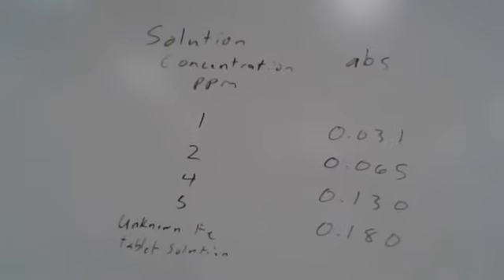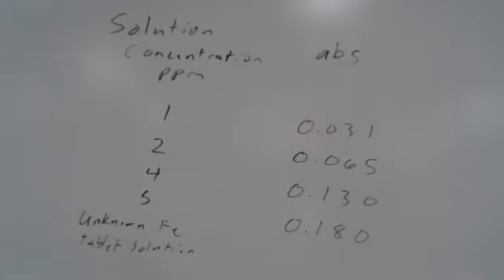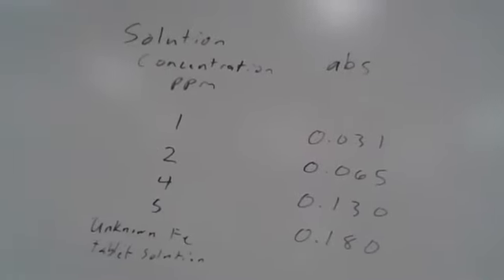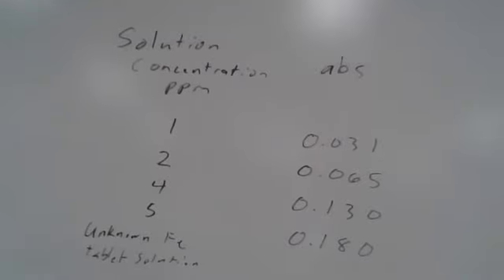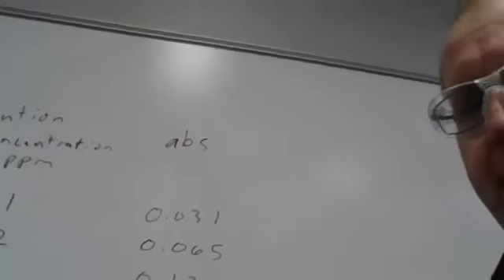So again, here it is, the solution and the concentrations and the absorbances that we have. Notice you should have more significant figures on that, but those should be pretty accurate there. This is the data that you're going to need in order to make your graph.